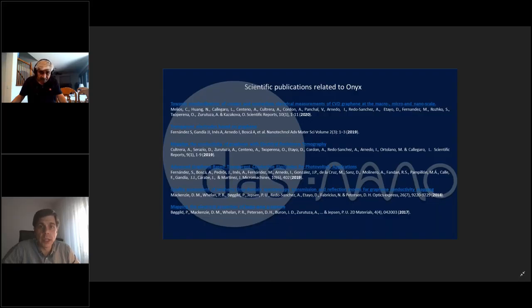If you're usually doing the same experiment, then not a lot of information is required. But if you are modifying your thickness and your number of layers and these kinds of things, then yes, we would need this kind of information, like thickness and the range of the dopants that you're using.